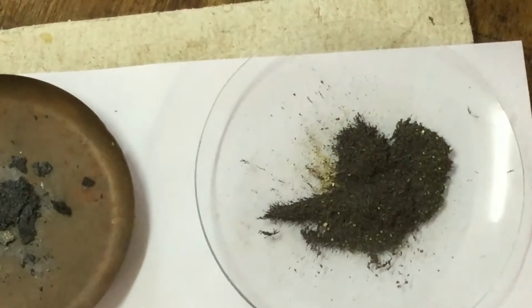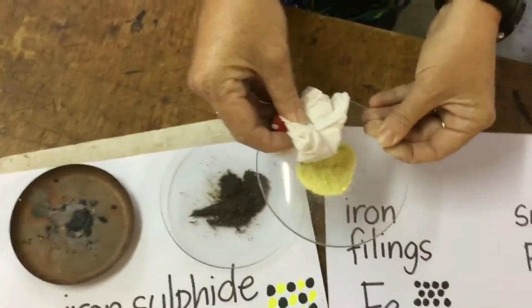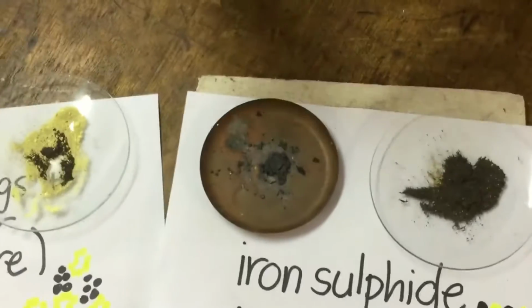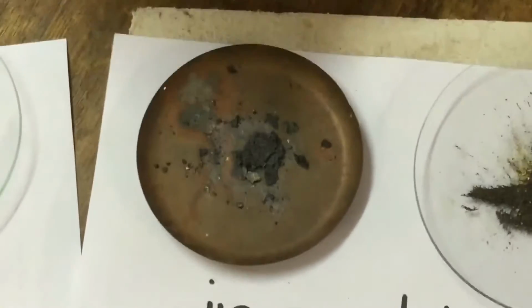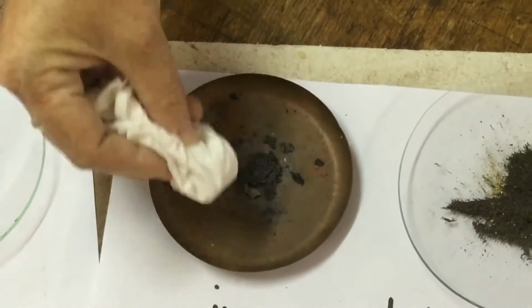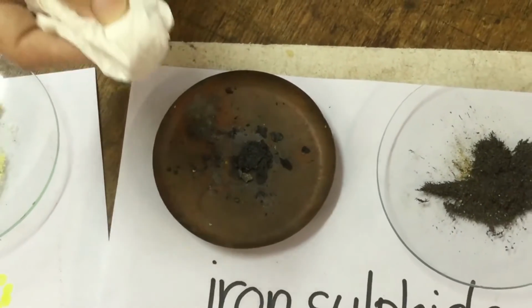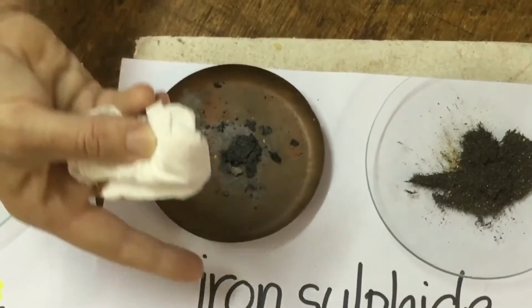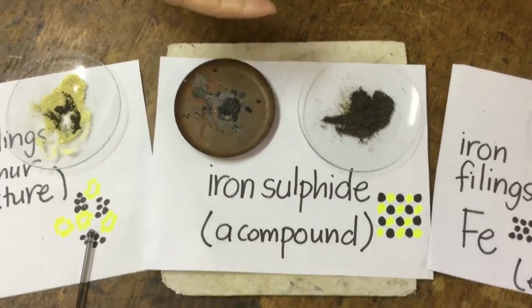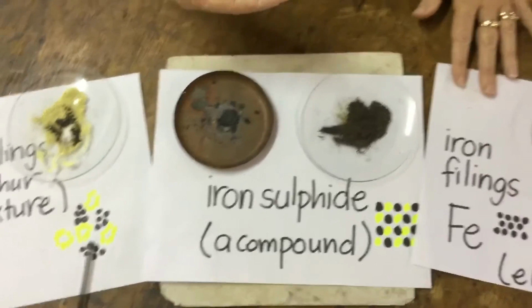And we said that the sulphur was non-magnetic. So the new substance that's been formed, the new compound iron sulphide, let's see if it is magnetic. We've got a new substance that is not magnetic because the iron is now part of a compound and has new properties because it is a compound.